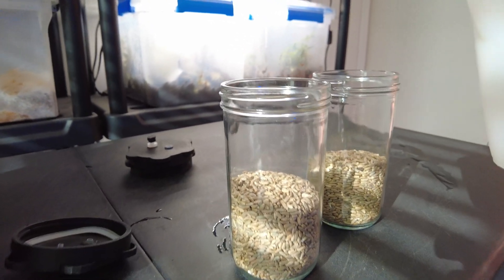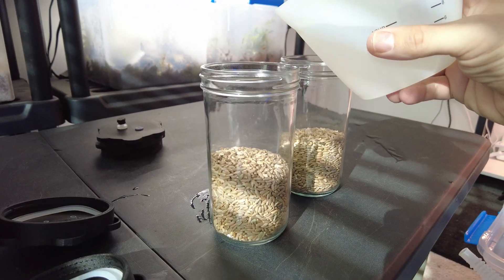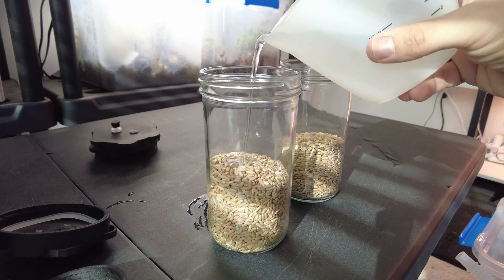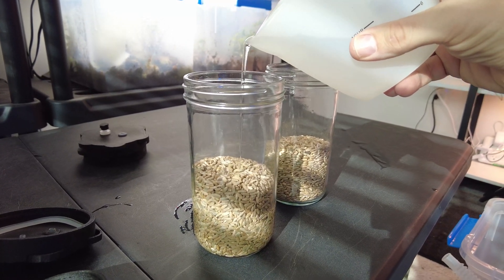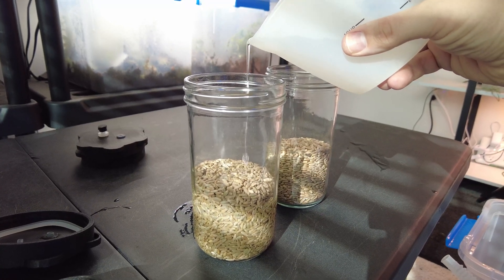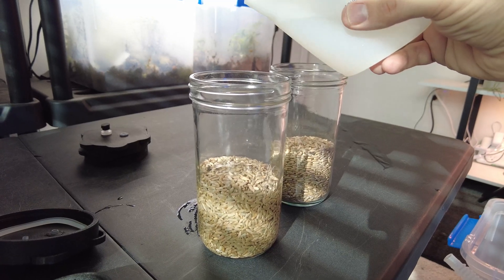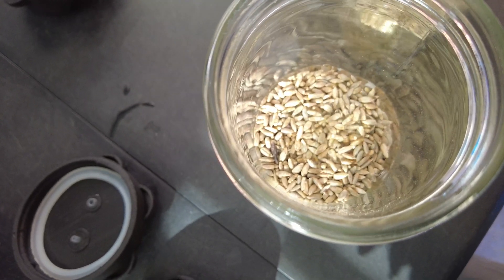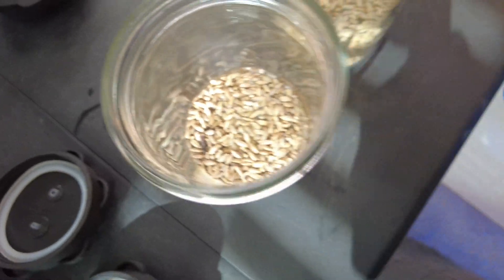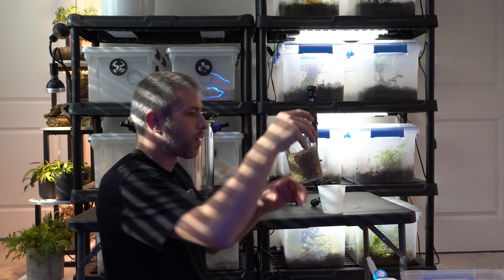Let me show you my trick for how much water to put in. I can't give you an exact amount of milliliters — this is one of those things you learn to do. I fill it until the water goes just right above the grain — not too much, not too little. Then give it a little shake to work the water into all the cracks and crevices until everything is submerged.